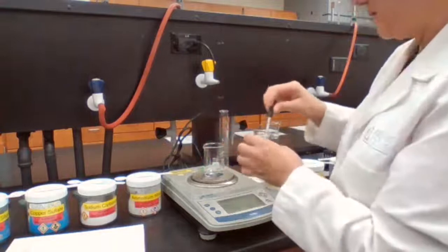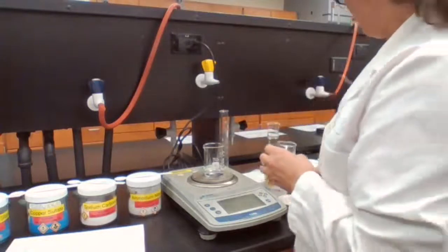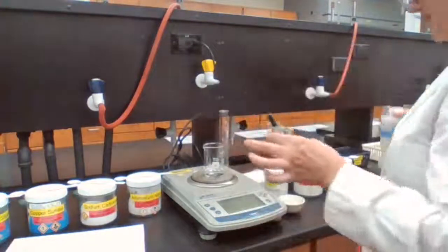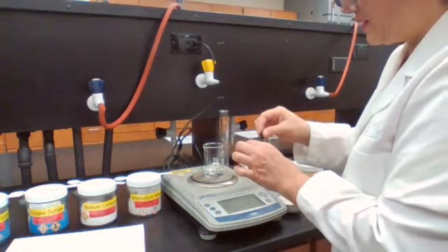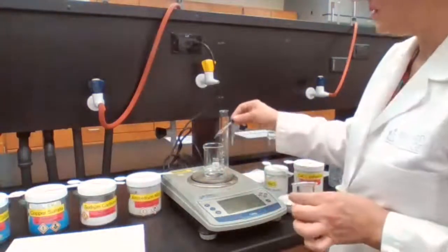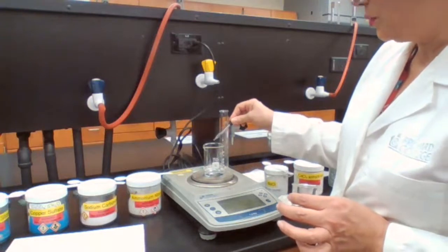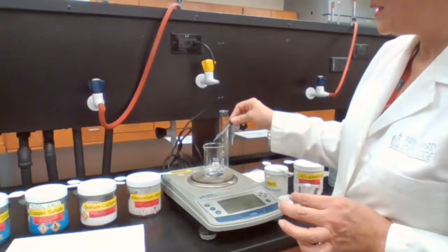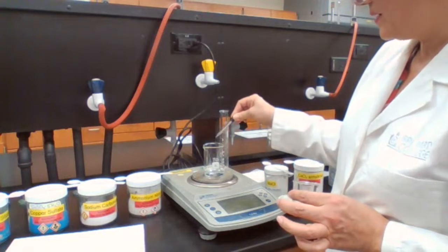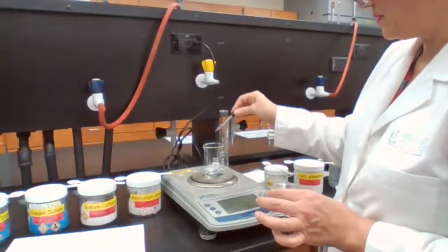It would have been smart if I put like 21 milliliters or 21 gram using the wash bottle that has deionized water sign on it, and then use the last 1 gram with the dropper, adding 1 drop at the time. It would probably make it easier and faster for me. So you pour faster to get approximately to the number we needed, and then we add drop by drop until we get to the exact number, which is 22.00.